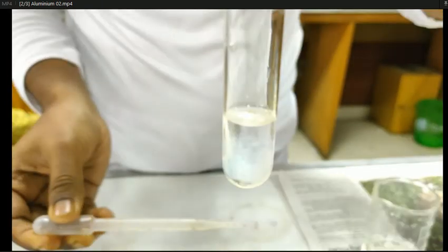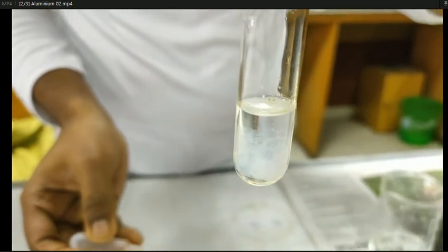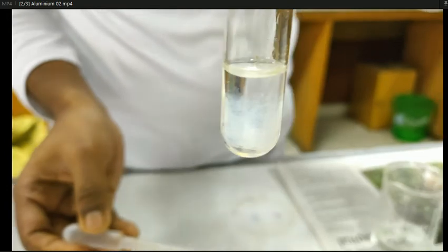Excess addition of ammonium hydroxide will not cause the solubilization of this precipitate. We are adding excess ammonium, and the precipitate will not dissolve. This is indicative of the presence of aluminum ion.